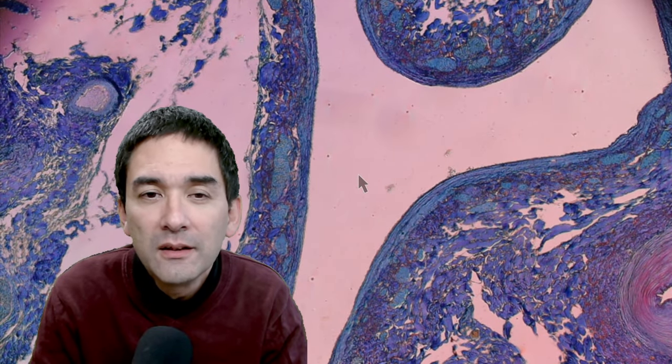But I can also show you a vein. The vein is next to the artery over here, and you might even have difficulty finding it. But the arrow now points to the inside of the vein. Look at this. I'm actually going to go from end to end. Again, this is a cross-section.